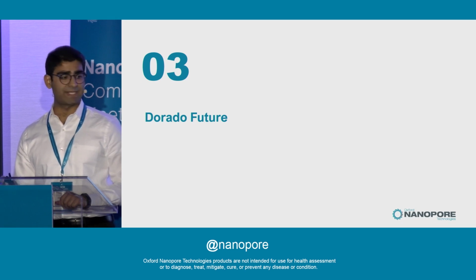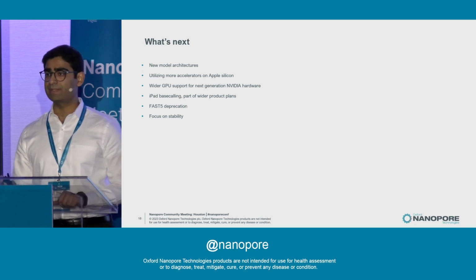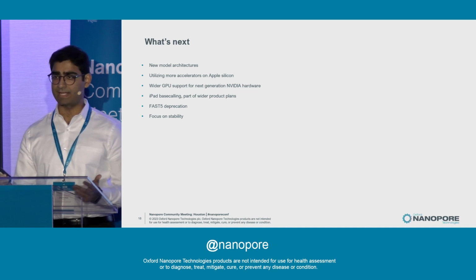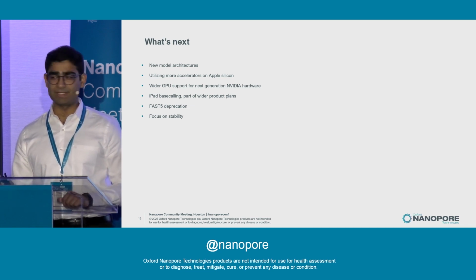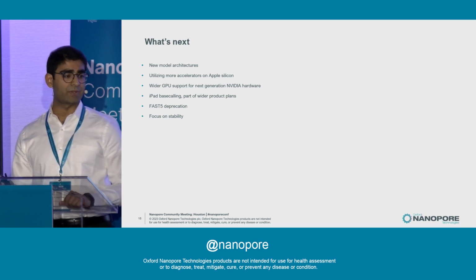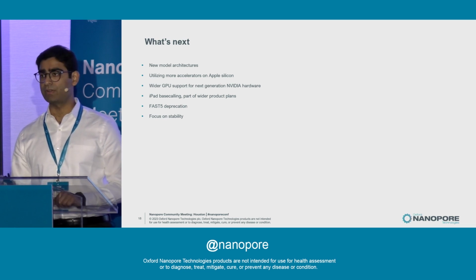All right, so what's next for Dorado? So we're going to continue exploring new model architectures to push the boundaries in terms of basecalling accuracy and get that in your hands as soon as possible. Performance, of course, remains a key focus for us. So we want to use more of the accelerators on the Apple silicon, as well as extend GPU support to the next generation of NVIDIA hardware.